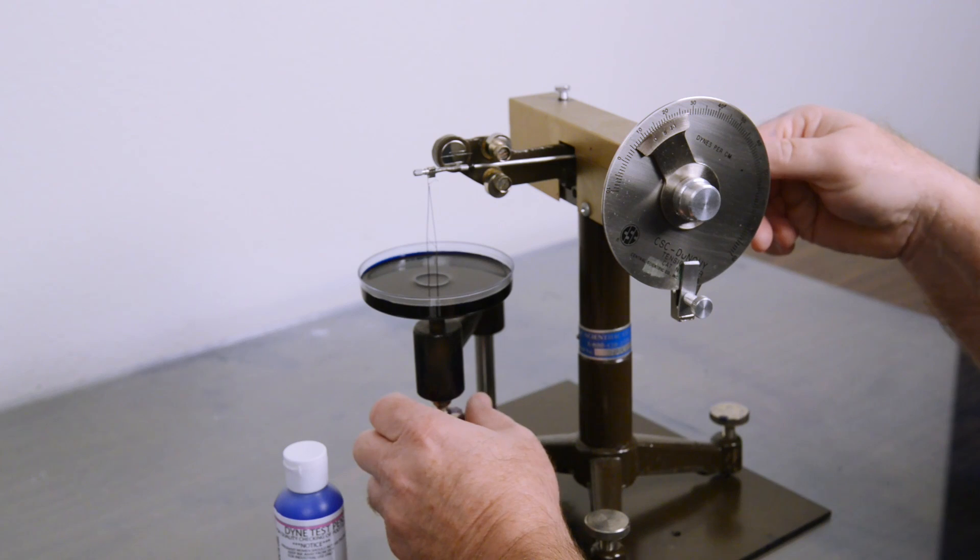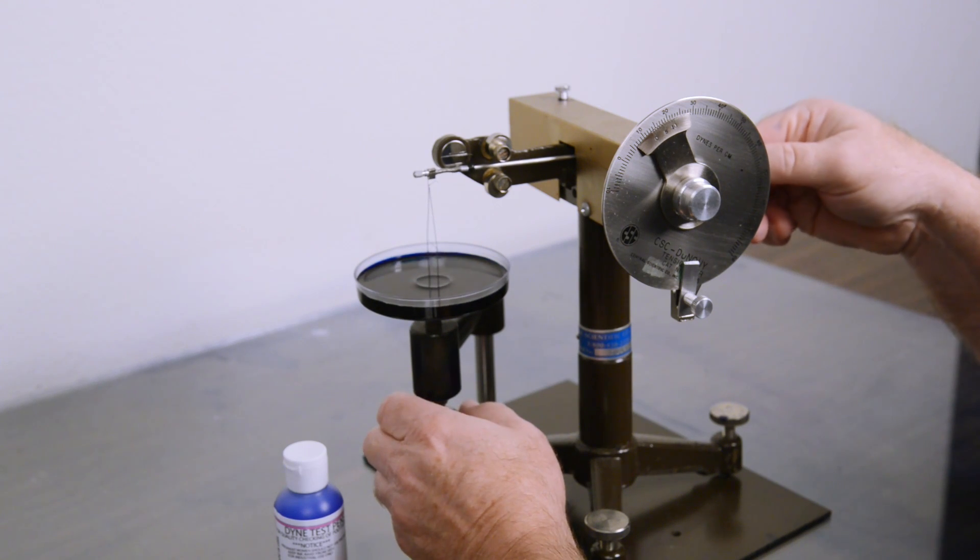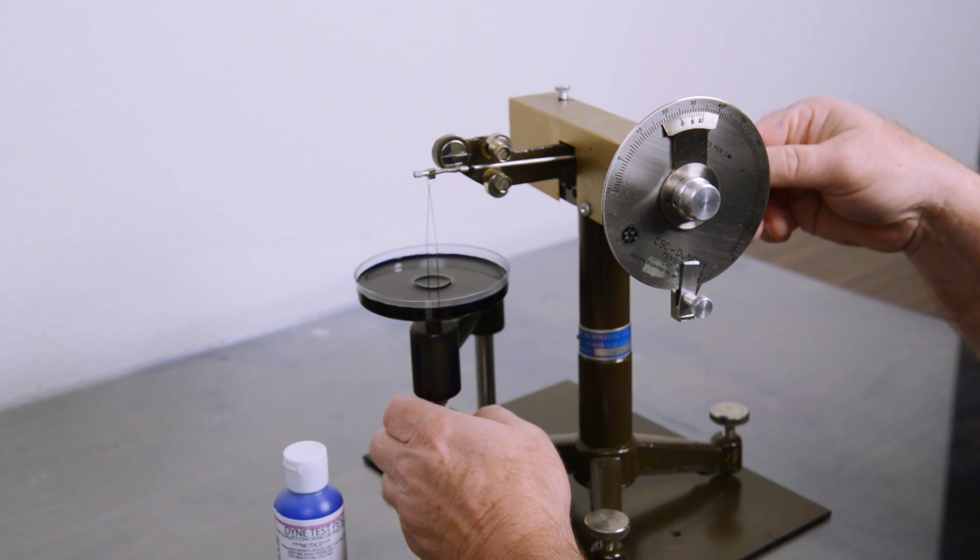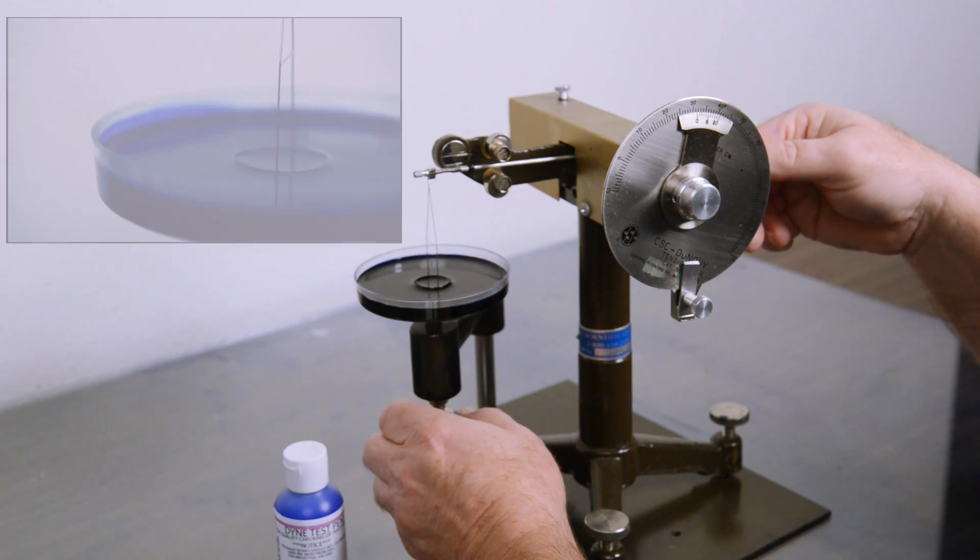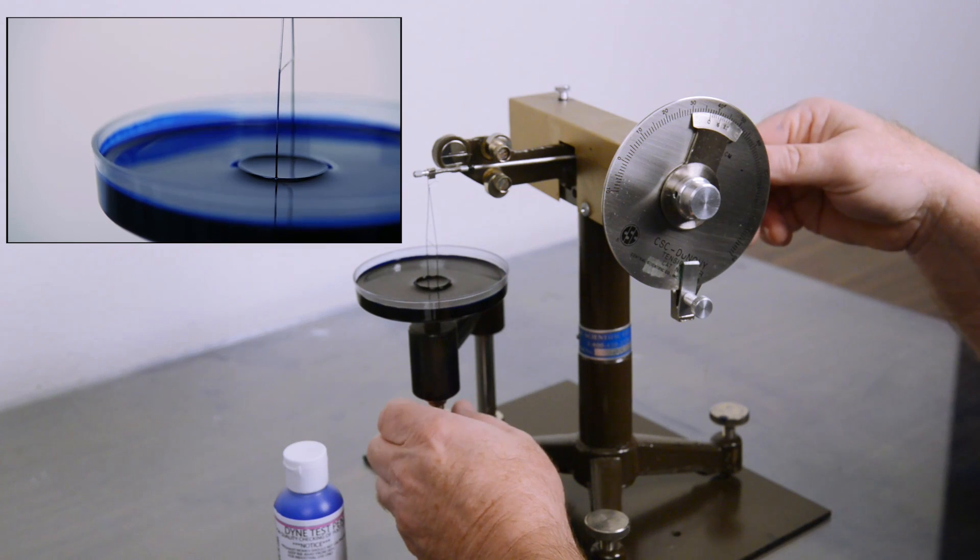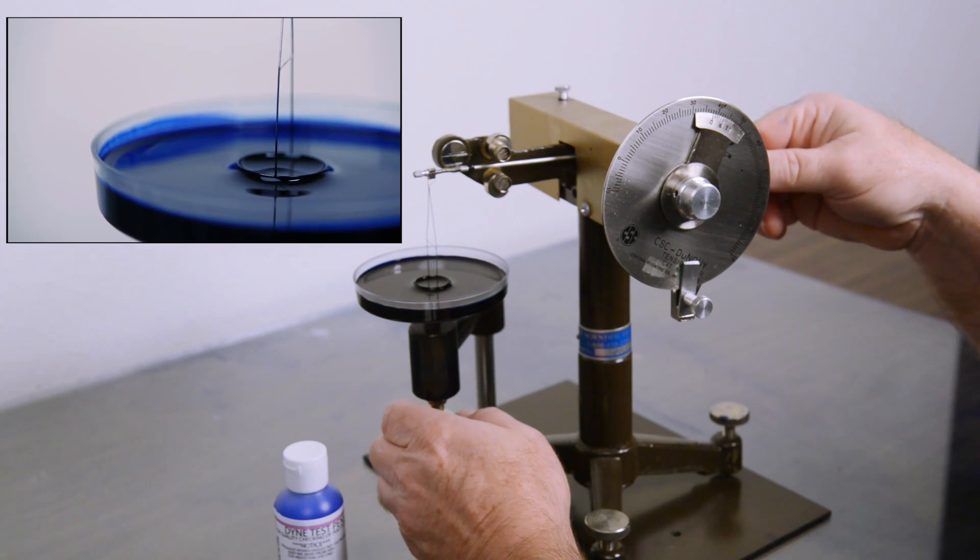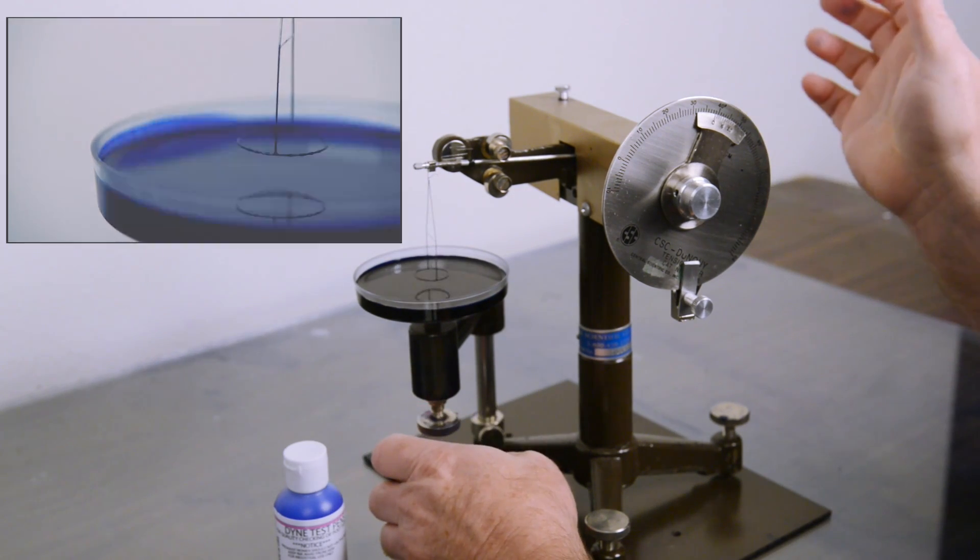We can start turning the dial for the tension. While still lowering the arm, raising the tension, lowering, raising, lowering, raising, and we are going to start looking to see where the bubble breaks, which it breaks.